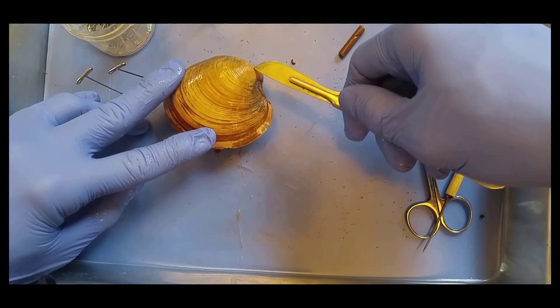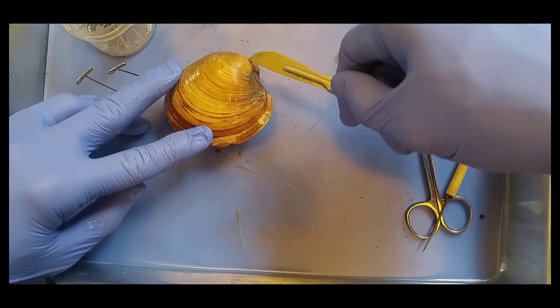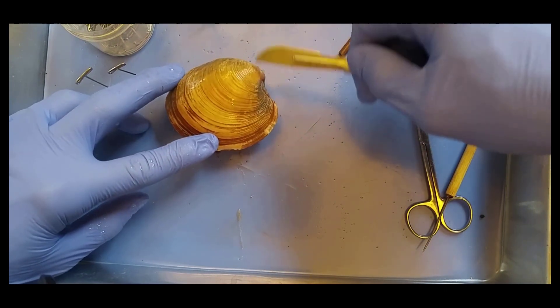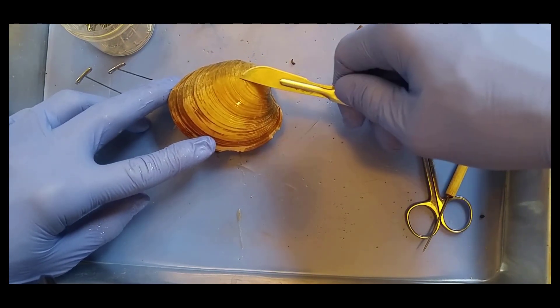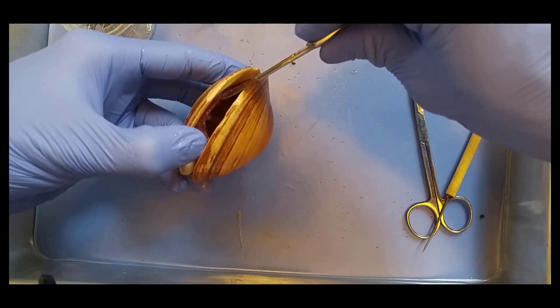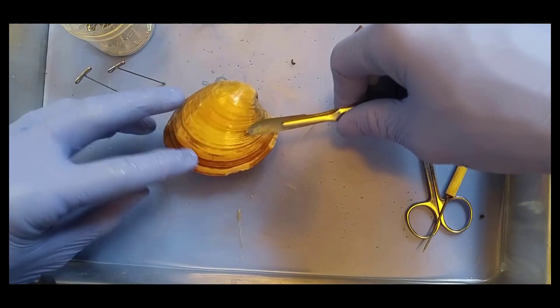This part right here is the oldest part of the shell. It's called an umbo. Can you say umbo? Umbo. Very good. So this is the oldest part of the shell, and the shell is made by the little tissue in here called the mantle. So the mantle secretes the shell.